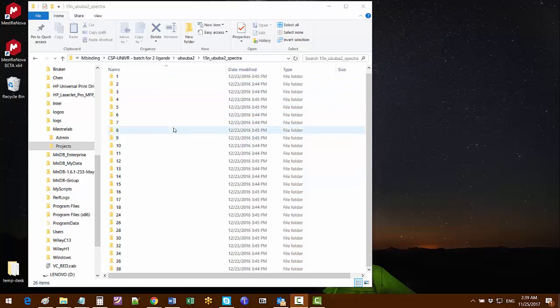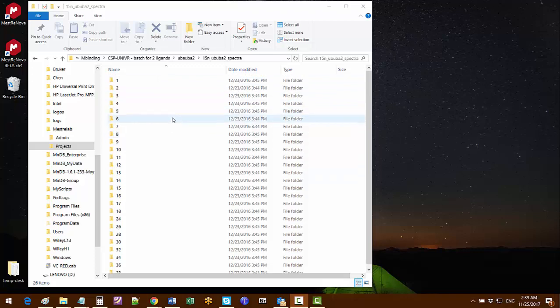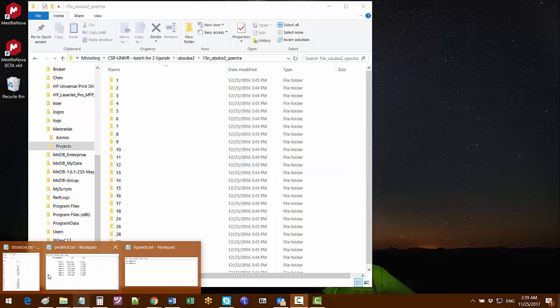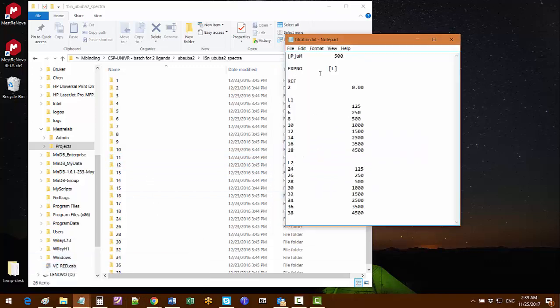As you can see in this dataset we have 38 spectra and some of them are for one ligand, L1, and some are for another ligand, L2. Each series has the various concentrations of the ligand and the same concentration of the protein as listed in this titration text file.